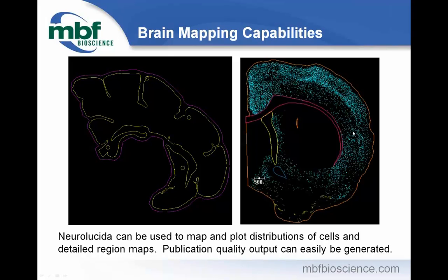So Sue, what do you mean by a desired level of accuracy? Well, I'm glad you asked. Absolute accuracy comes in two flavors when you're performing brain mapping. The anatomical specificity is actually very important because you want to be certain that the marker that you're placing for the cell that you're interested in is within a particular region of the brain. And so understanding where you are in the brain by using an atlas or consulting somebody is very important. The actual number of markers that are placed is of less importance.